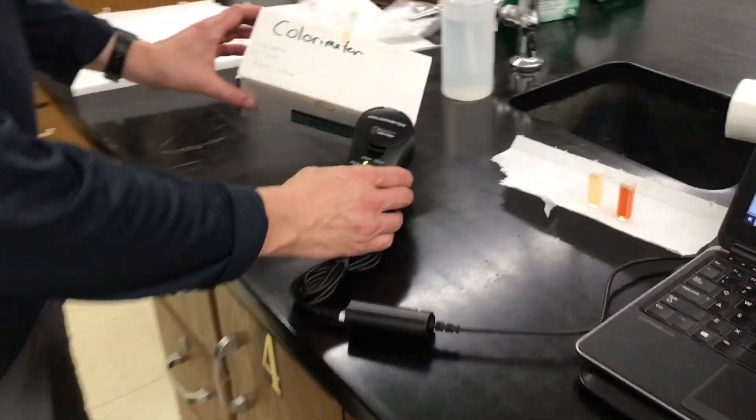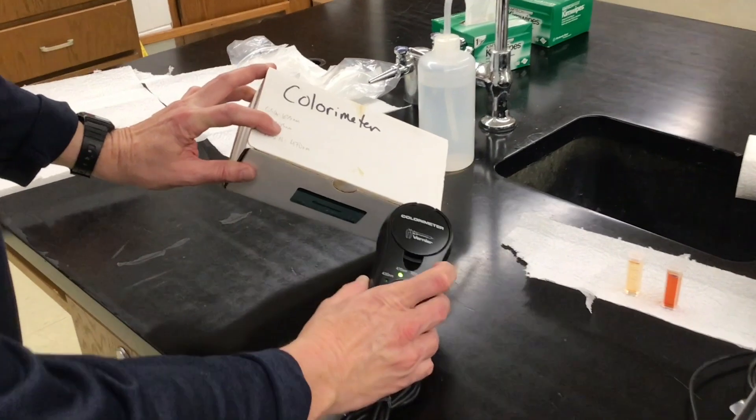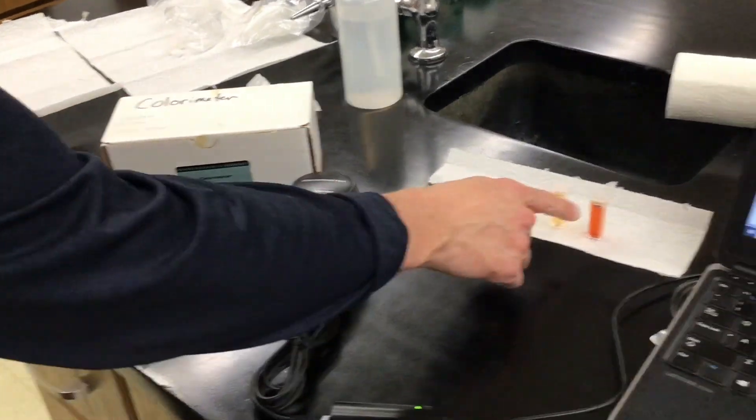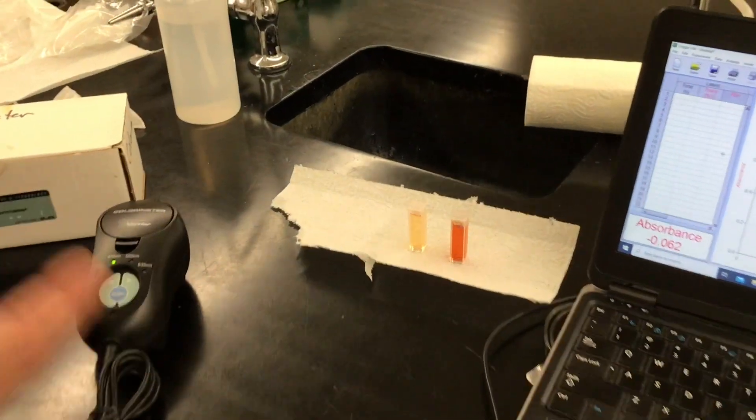Okay, first of all, I have the wavelength set at 470 and that's in the blue region because we're measuring a red solution. So we want a different color.